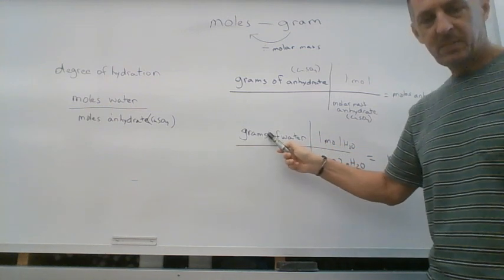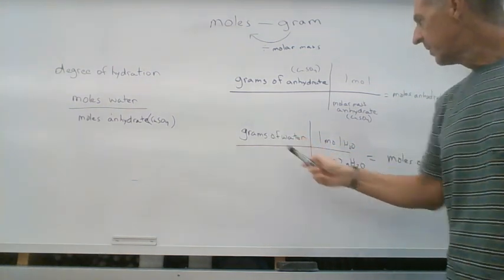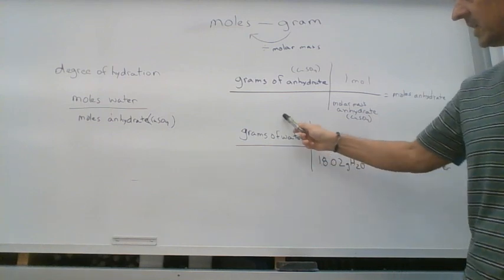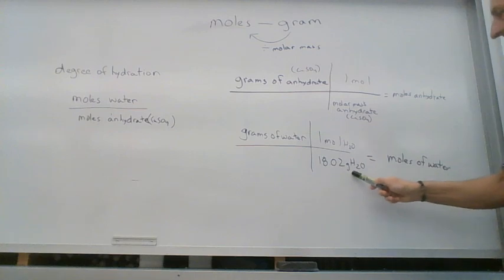We know how many grams of water we drove off. We know the molar mass of water. There's 18.02 grams in every 1 mole, so you're going to divide your grams of water by your molar mass of water, and that gives you moles of water.